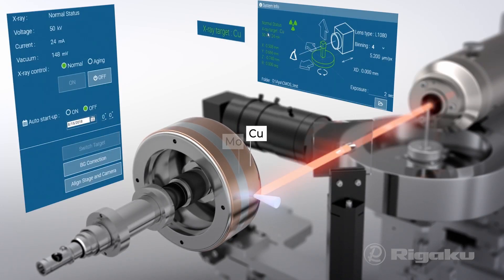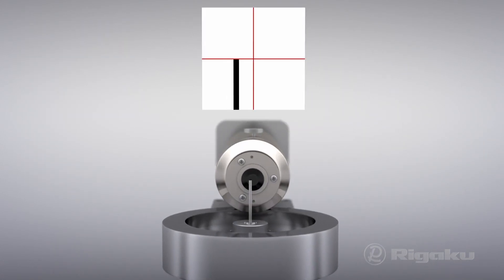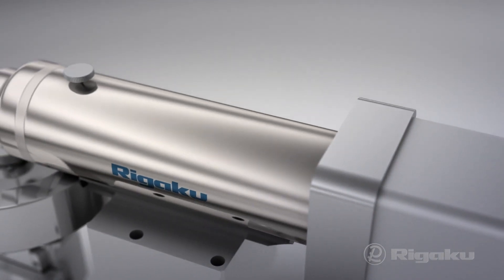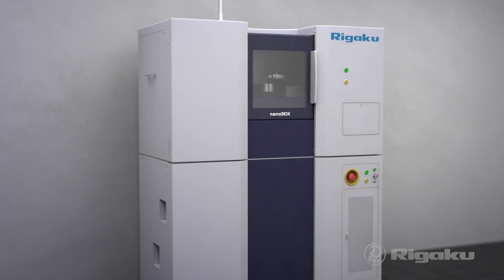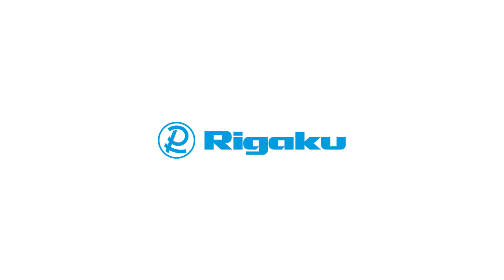Easily switch resolutions and wavelengths — the system aligns automatically and is ready to scan in just minutes. When coupled with a CMOS detector, Nano 3DX is fast enough to do dynamic time-resolved 4D measurements.